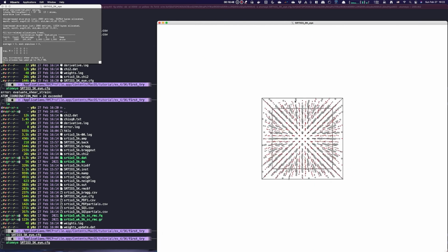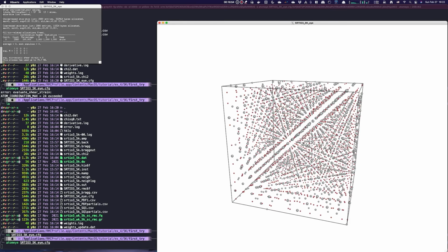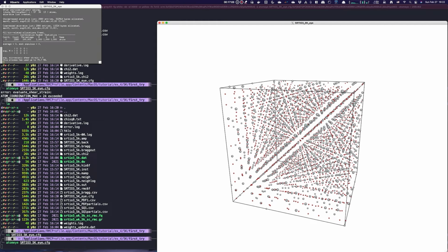Although the atoms may look a little bit small, once you open the program, you can use the mouse to rotate and to zoom in and out, and probably press the B button. Sometimes it's working, sometimes it's not. I'm not sure why, but usually when you press the B button on the keyboard, it will add bonds to this configuration. Oh, I see probably why, because we changed the unit length to be a little bit larger. Given some default value for the bonding information, it's probably not going to recognize any real bonds because the distance now is not right.